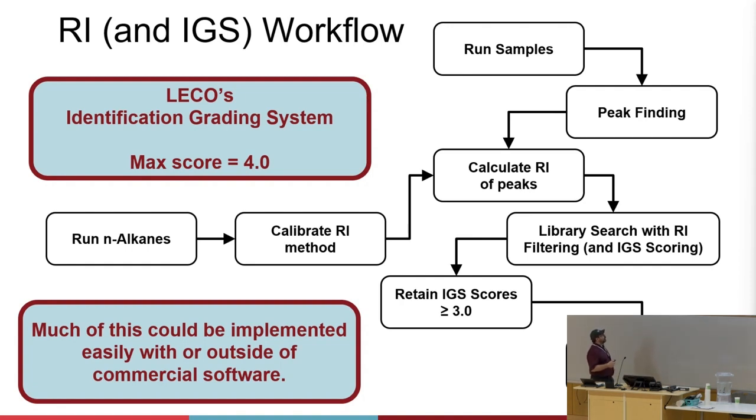Now, we're using this stuff built into ChromaTOF, but much of this could be implemented very easily in other commercial software or pretty easily outside of commercial software, as long as you get a decent peak table and spectrum that you can dump out from the software.